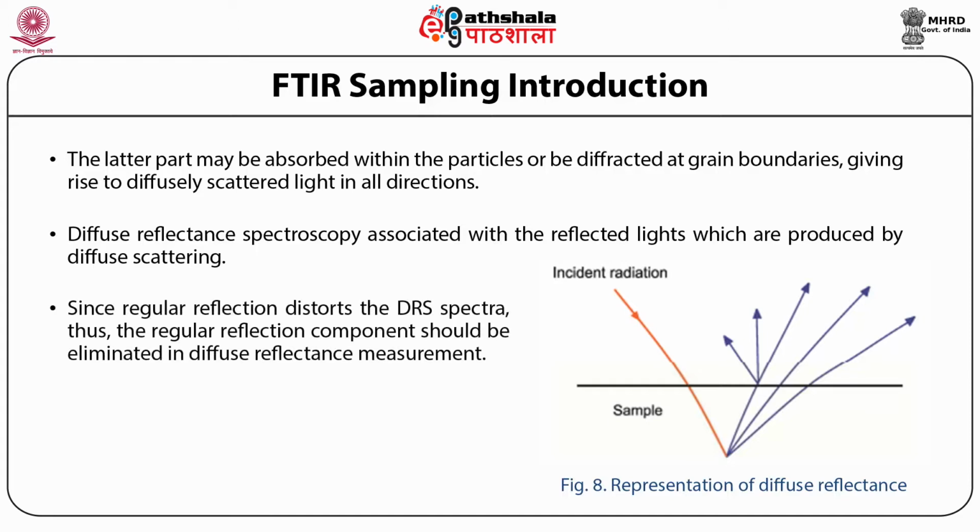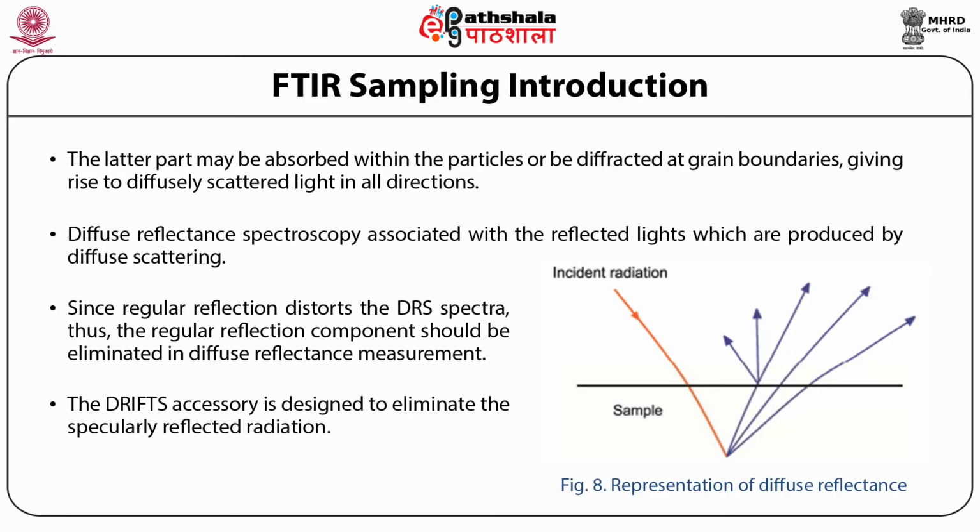Now, since regular reflection distorts the DRS spectra, the regular reflection component should be eliminated in diffuse reflectance measurement. So the DRIFTS accessory is designed to eliminate the specularly reflected radiation.